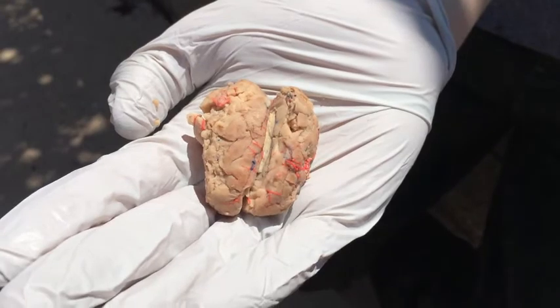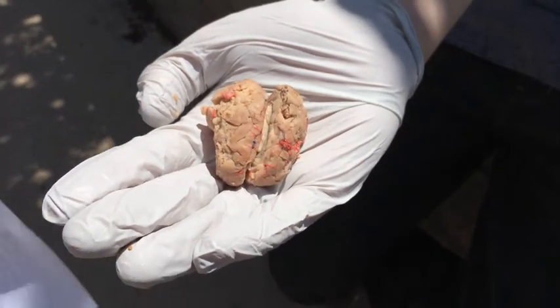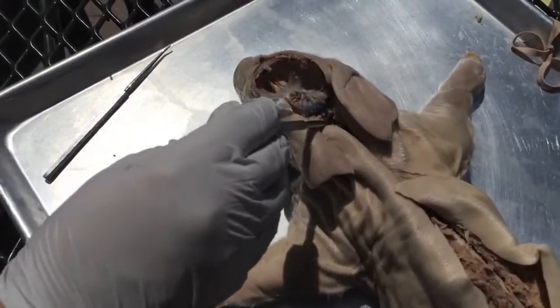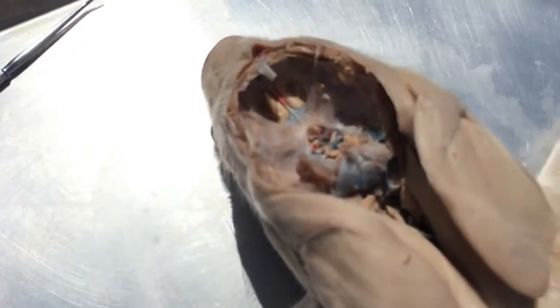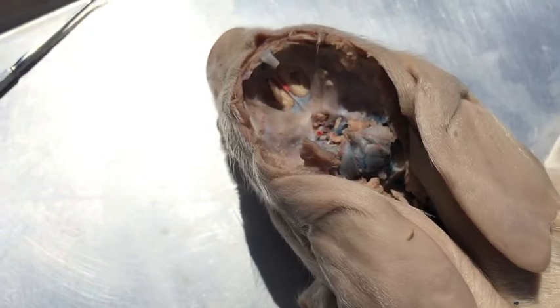And next we have the cranial nerves, which are back more on our pig, which are going to be more where the brain stem is, back here underneath. And basically what that is responsible for is the nerve that arises from the brain and the brain stem. It's not really going to be isolated, but it is back in there.